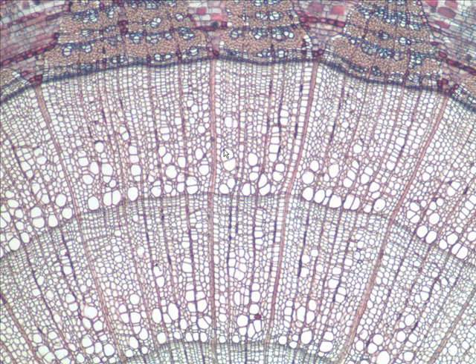And within each ring, we have some larger xylem cells and smaller xylem cells. Larger xylem cells toward the center of the stem, smaller xylem cells toward the outside. We have the same thing in the middle ring. Larger cells toward the center of the stem, smaller cells toward the outside. Each ring has this same phenomenon.